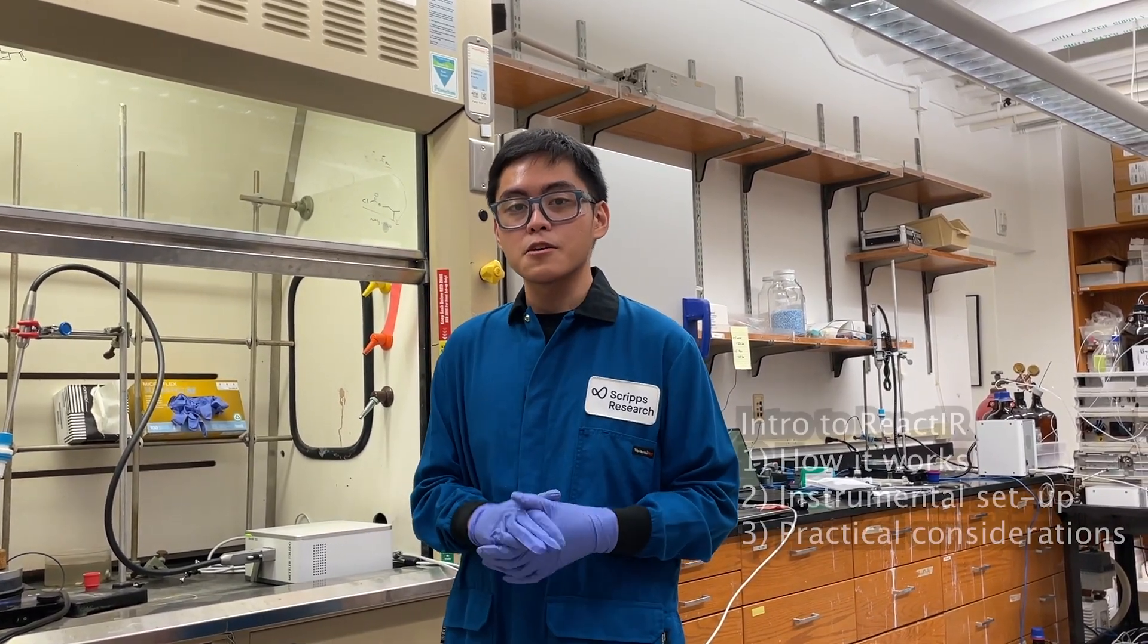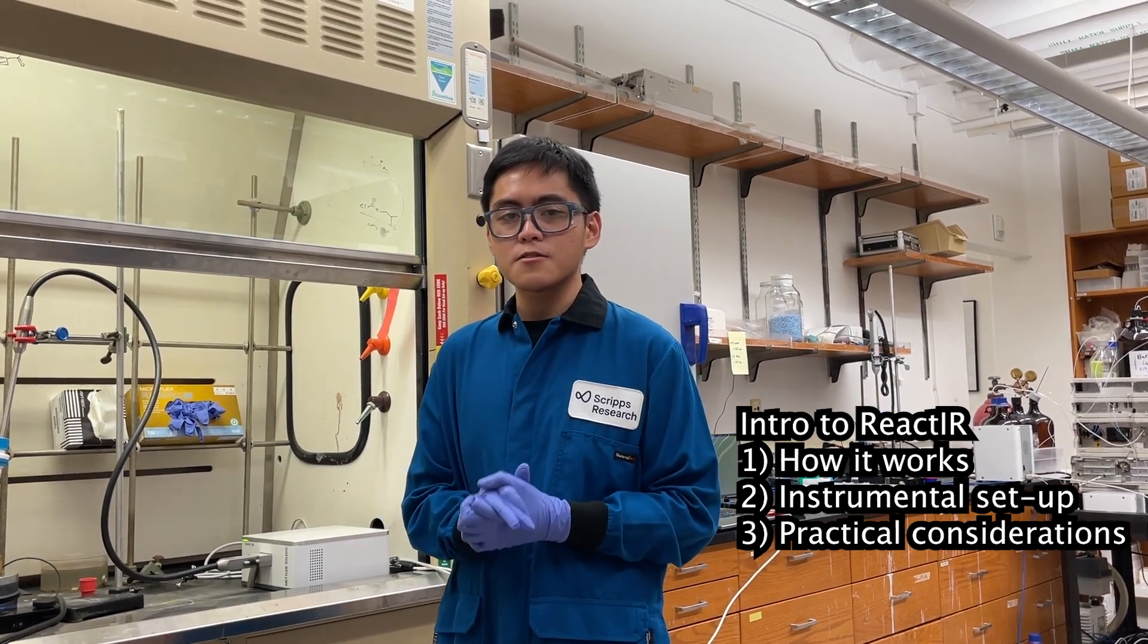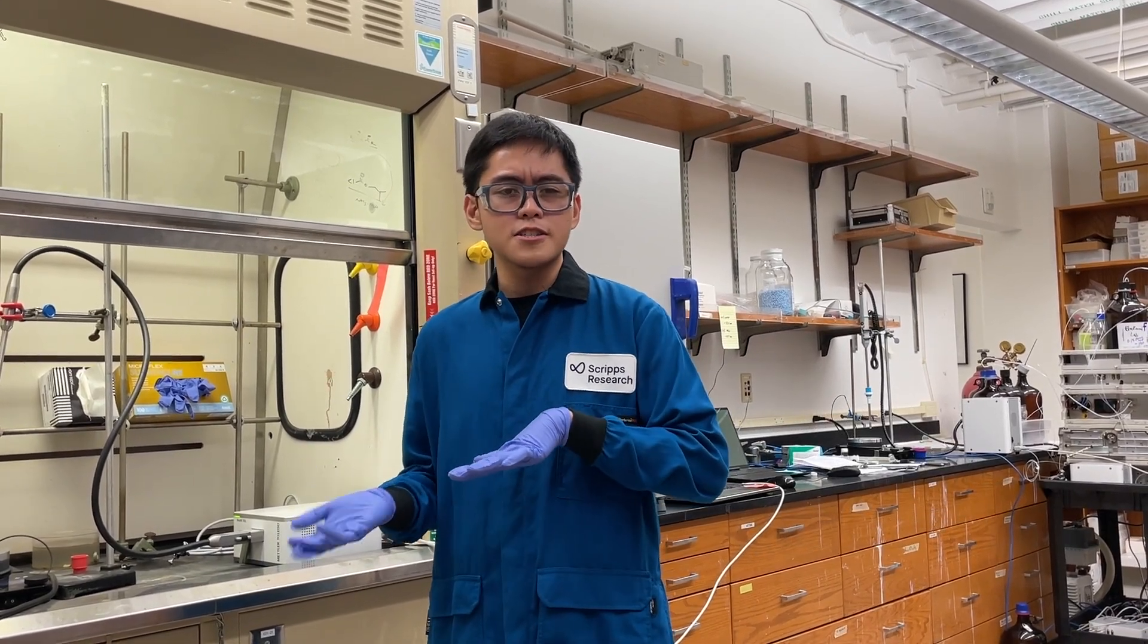In particular, we're going to go over how it works, the setup, and also some practical considerations to think of when running a reaction. So whether you're new to this instrument or you just need a quick refresher, this video is for you. Let's get started!